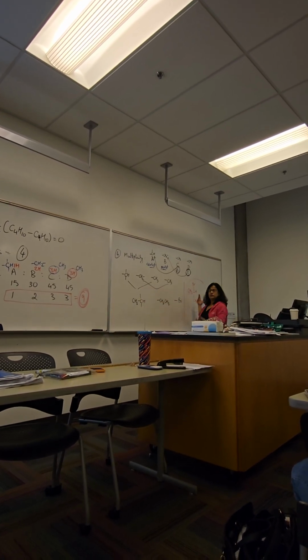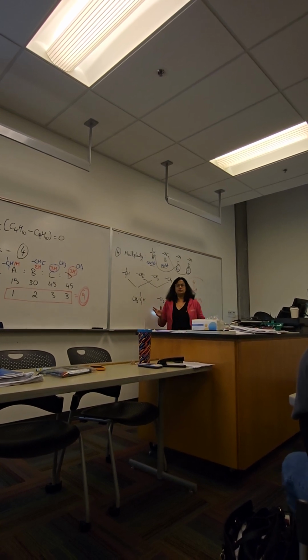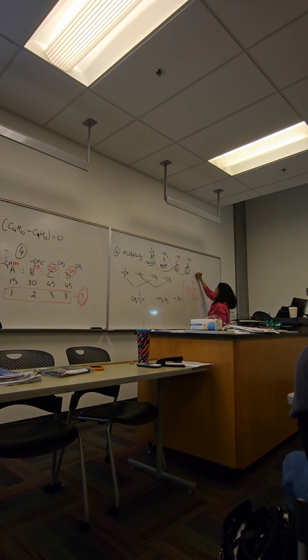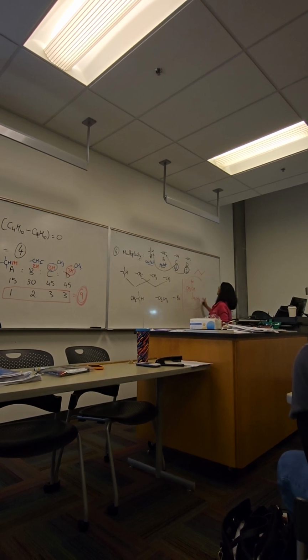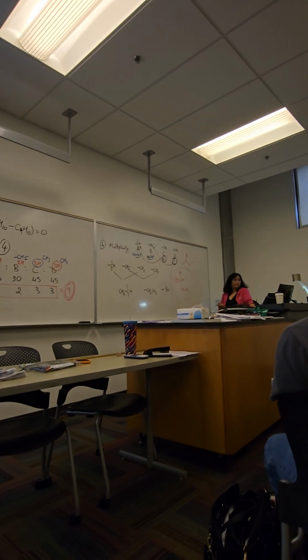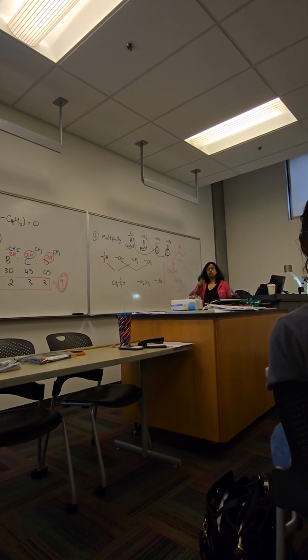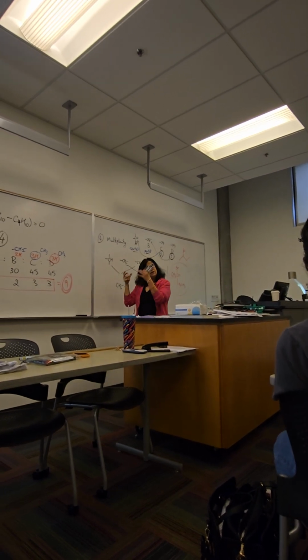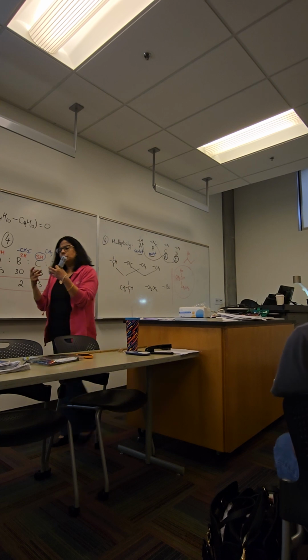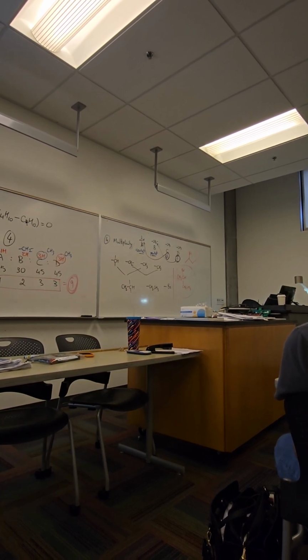Now does this go on the top or bottom? Who cares? We're not showing stereochemistry here. You could have put this, I mean, anyway, it doesn't matter. So you could have just drawn, that's the structure. Everybody's seeing this. So we are gathering clues and then coming up with pieces and then trying to put the pieces together that would make sense based on the spectrum.